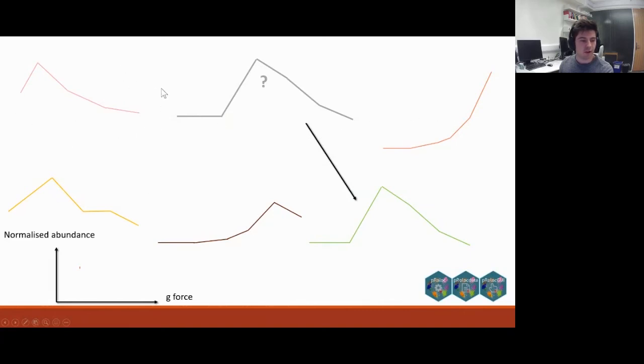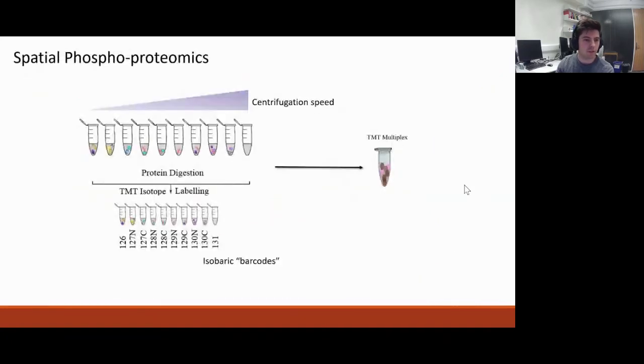So these are the profiles from those markers that we saw before. And we can do this using machine learning algorithms that are implemented in our Bioconductor packages. Simplistically, this is association by correlation, and in reality, something more complex is happening.